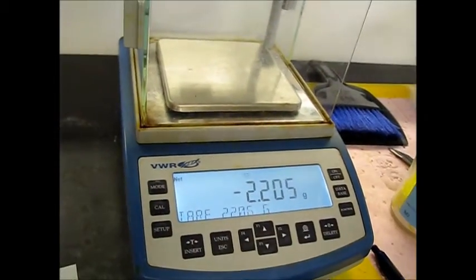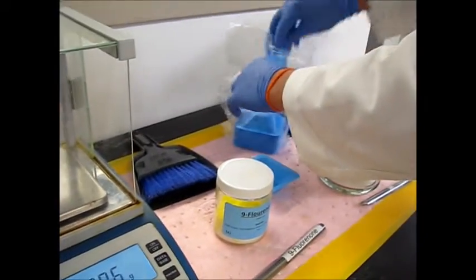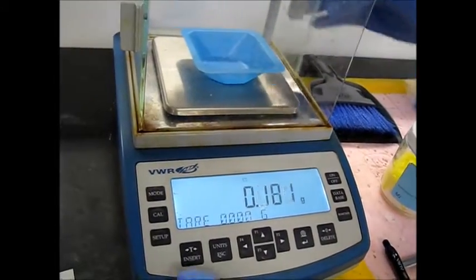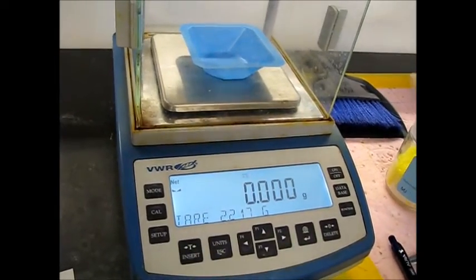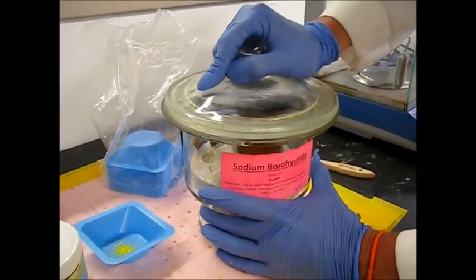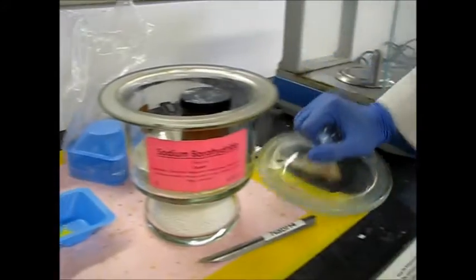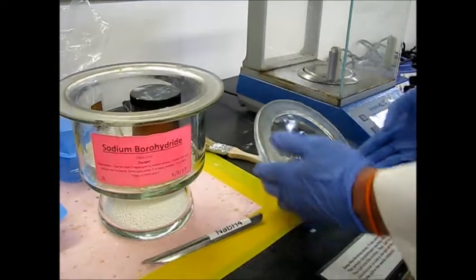Now we're going to weigh out 50 milligrams of the sodium borohydride. Once again, we need to make sure we zero first. Whenever you take off the lid of the desiccator, you want to slide it off. It does have grease on the lid, so it will be a little bit sticky, but once you get it to slide, you want to make sure you don't set it down face down like this, because the grease will pick up all of the junk right here. So you want to set it down just like this.